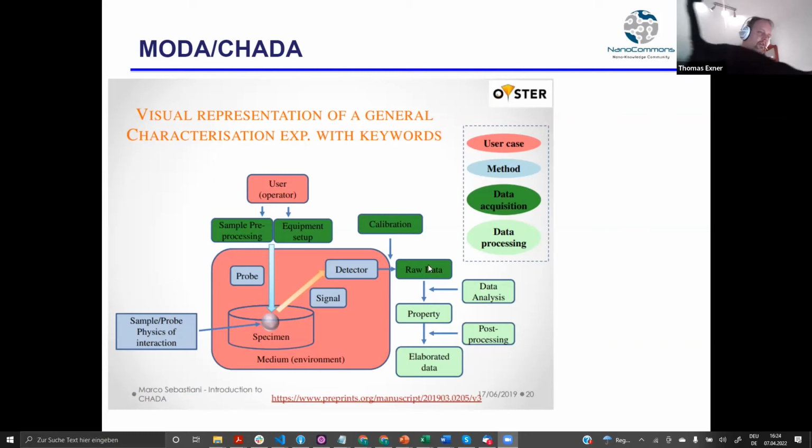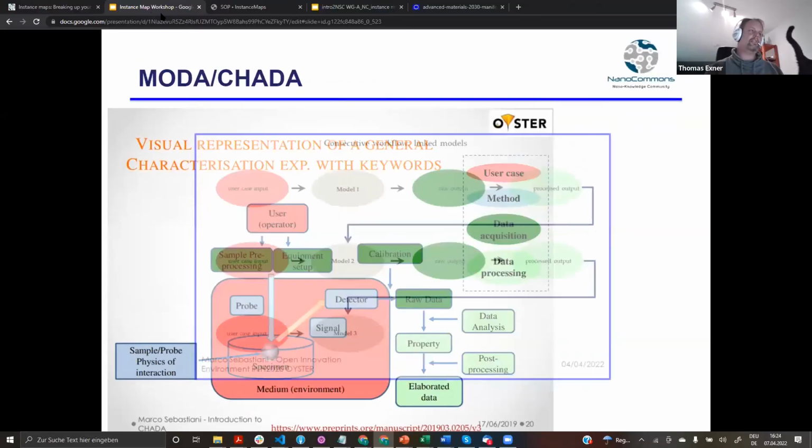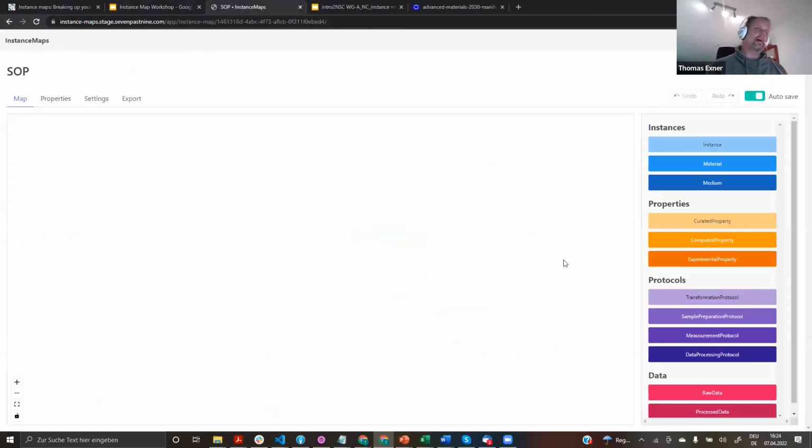And when you then go back to the instance map tool itself, I think we should also think about what kind of areas would be put in. What I already saw as a starting point is clearly we need some kind of controls. If you want to become more and more detailed, we probably would need some nodes for controls, for control handling, for quality control.